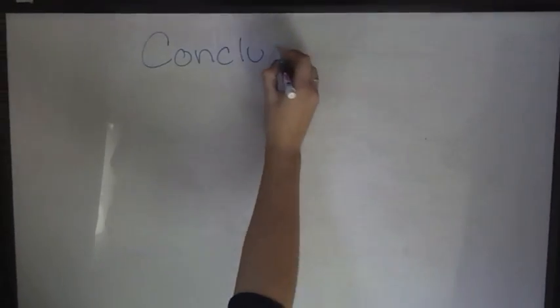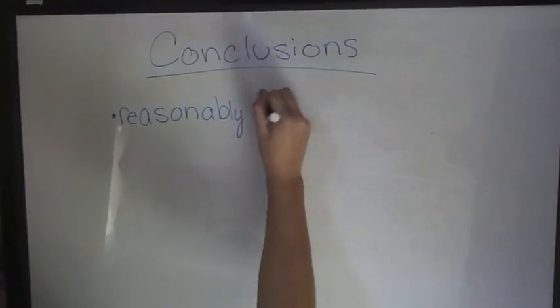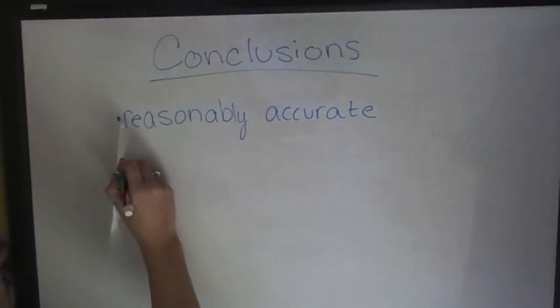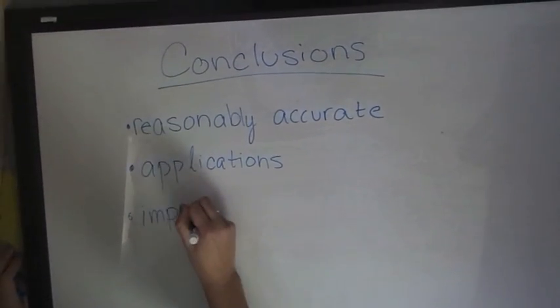In conclusion, we found reasonably accurate data to support thermochemical equations. We were also able to practically apply knowledge learned in the classroom and understand the impact of Hess's law and thermodynamic concepts in the world of chemistry today.